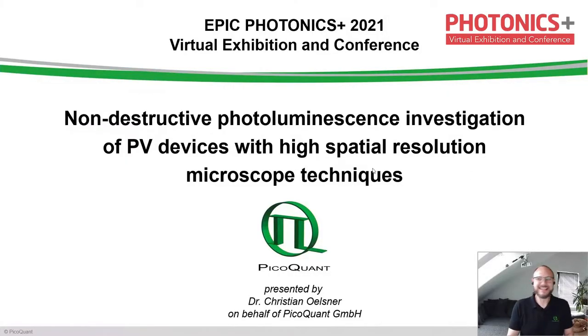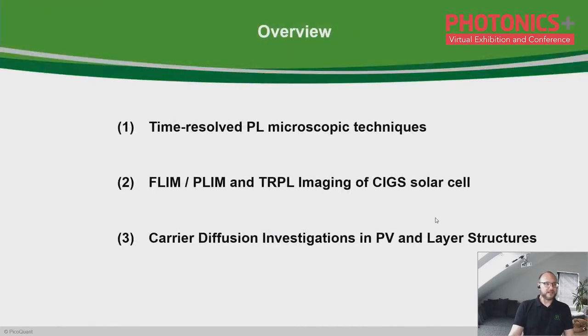So my talk today is about non-destructive photoluminescence investigations of photovoltaic devices with high spatial resolution and with different microscope techniques. At first, I give you a brief overview about time-resolved photoluminescence techniques so that you get an idea what's possible and what's the state of the art. Then I will go on with explaining a little bit about fluorescence lifetime imaging, phosphorescence lifetime imaging, and of course, time-resolved photoluminescence in combination with a spectrometer, for instance, on the example of a CIGS solar cell.